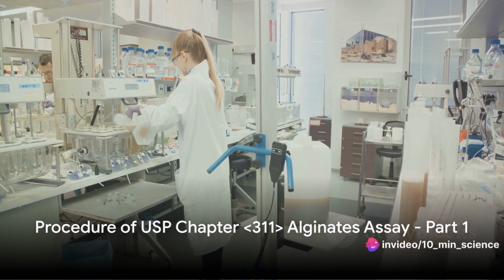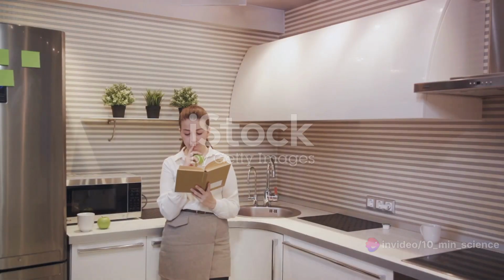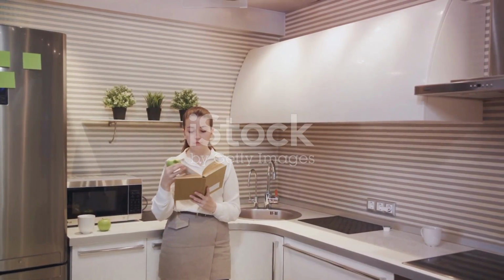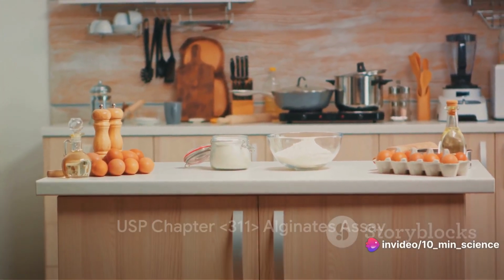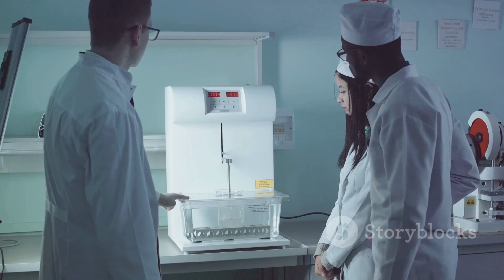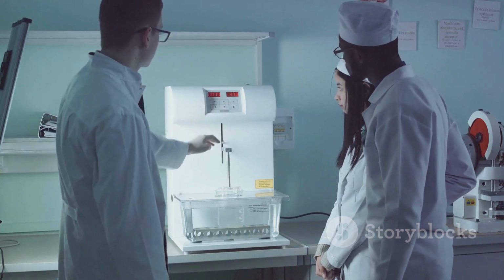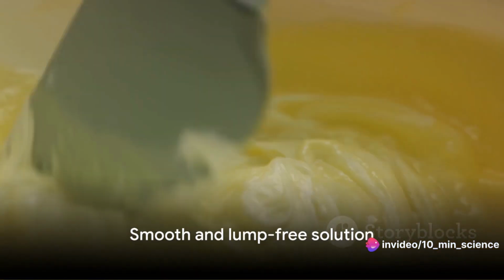Now that we have a basic understanding of alginates, we can proceed with the assay procedure. The first part of the assay procedure involves preparation. It's a bit like cooking, wouldn't you agree? Preparing a meal requires a well-organized kitchen, quality ingredients, and just the right recipe. Well, the same goes for the USP chapter <311> Alginates assay. First up is sample preparation. The alginates sample must be accurately weighed and dissolved in water to create a homogenized solution. It's essential to ensure the solution is well mixed to avoid any inconsistencies in the assay results. Think of it as making sure your cake batter is smooth and lump-free.